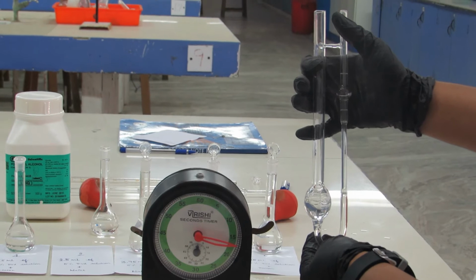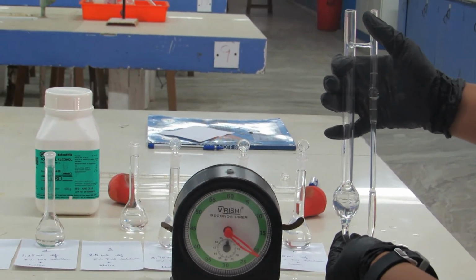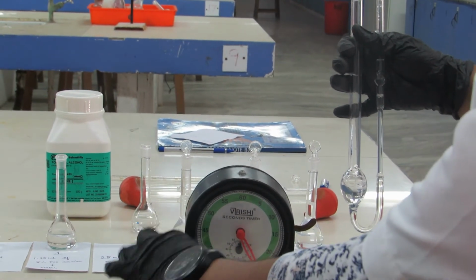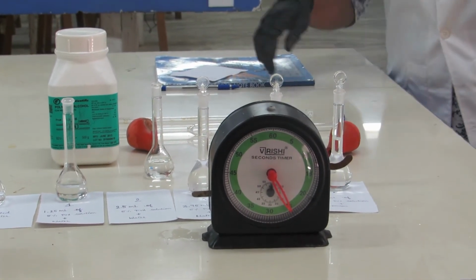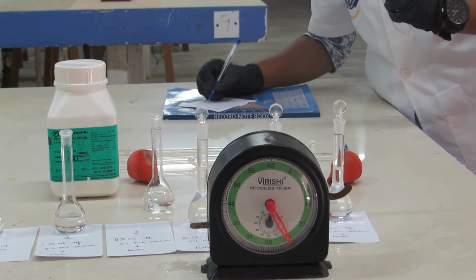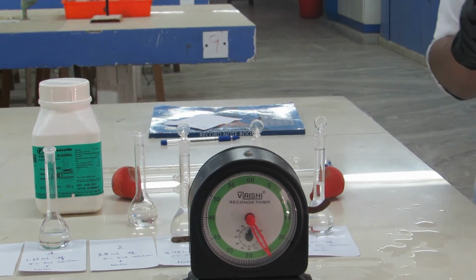Yes, we stopped, and you note down the flow time in your observation book. Okay, we have noted it. Okay, and we are going for the fourth measurement. Now three measurements are over. Okay, water, 0.25 and 0.5% are over.